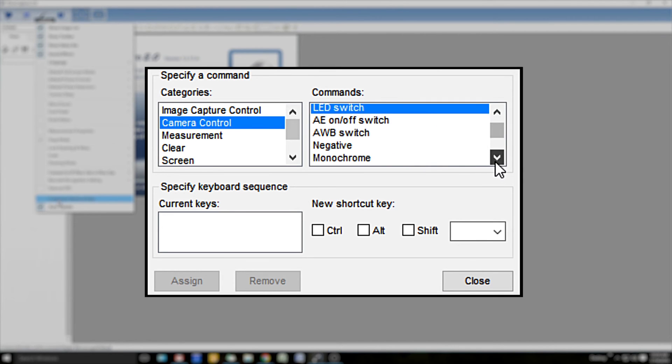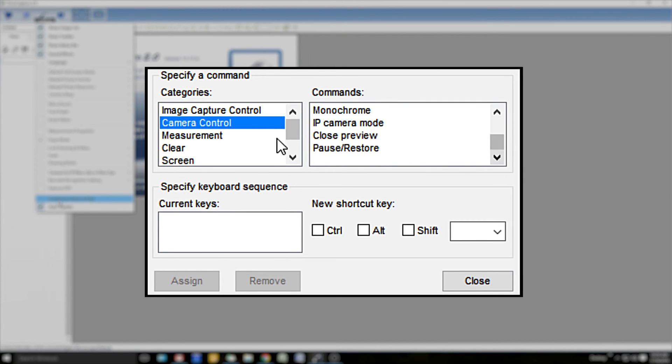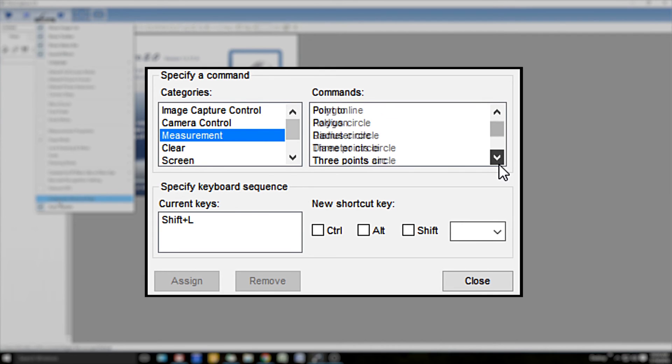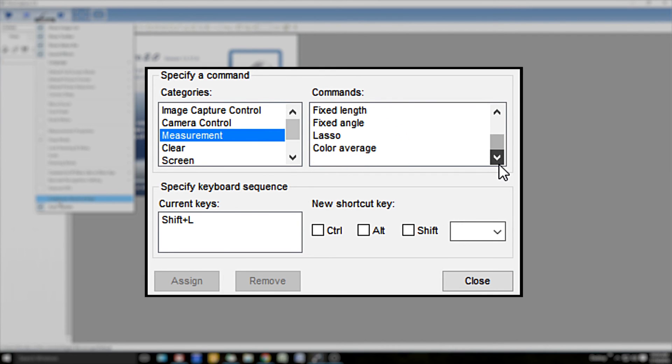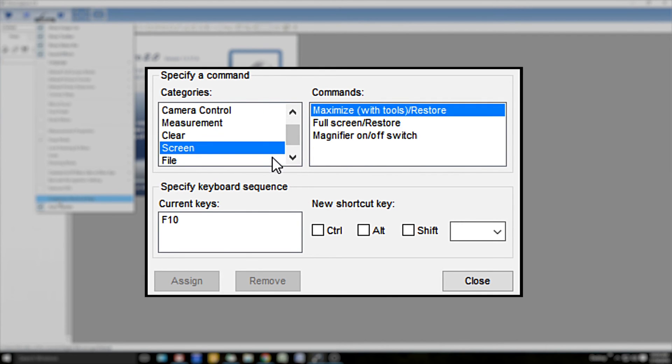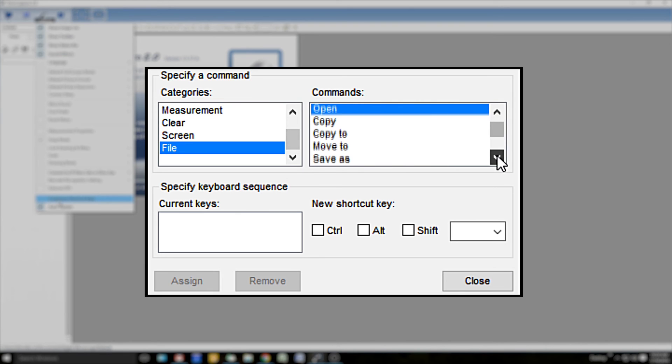Some of the command options are LED controls, performing measurement of any type, image, video, time-lapse, or EDOF capture, saving or deleting images, and much more.